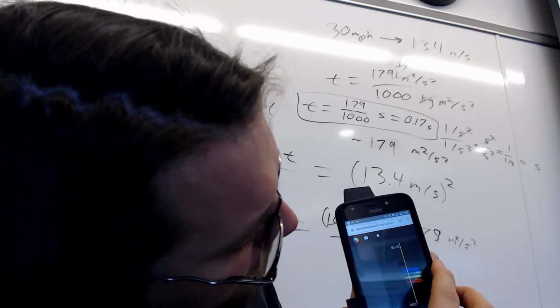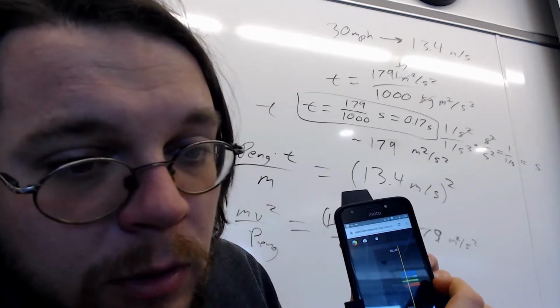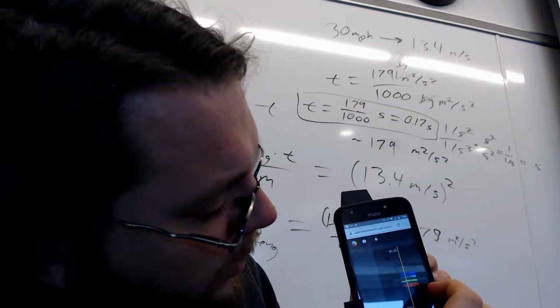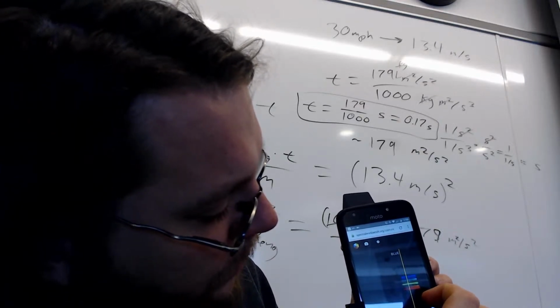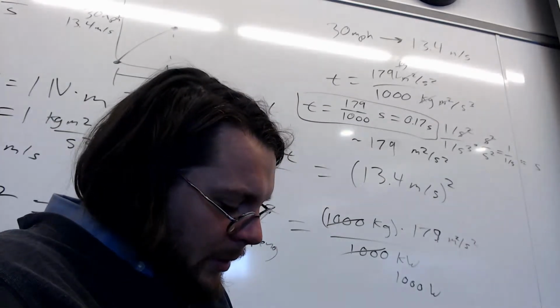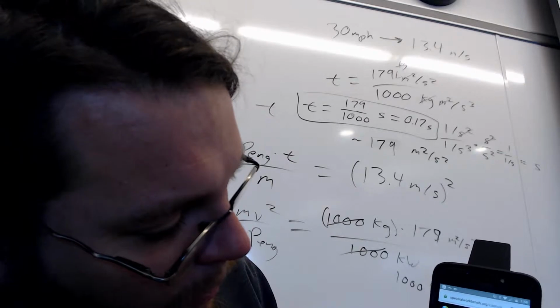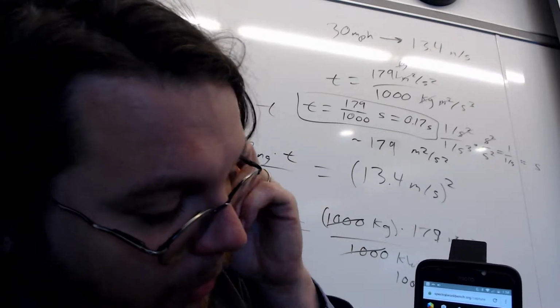But there we go. All right, so you see the little rainbow there? So you want the yellow line to go through the rainbow. I'm actually going to pause here, and I'm going to clamp this down a little bit more than it was, because I feel like that could help in the future. All right, so there we go. So now I'm getting this rainbow.